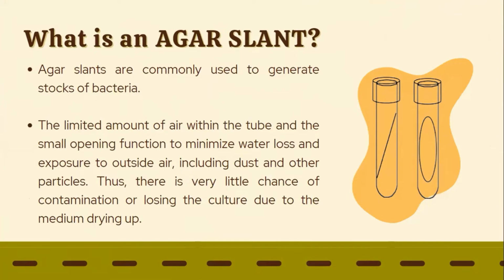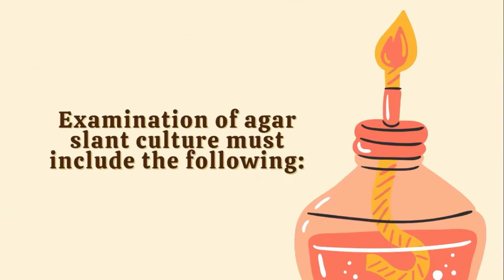The limited amount of air within the tube and the small opening function to minimize water loss and exposure to outside air, which includes dust and other particles. Therefore, there is very little chance of contamination or losing the culture due to the medium drying up. Examination of an agar slant culture must include the following.